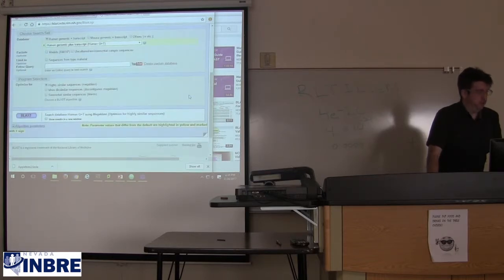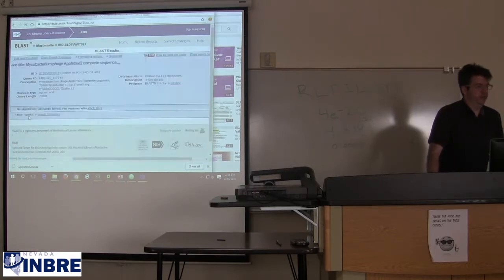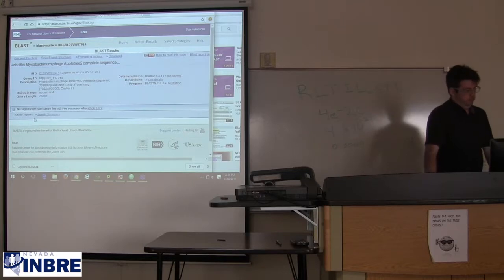And let's see if Megablast will find anything at all where we don't expect a relationship and where we're only going to be seeing things with poor e-values more than likely, and the noise of our algorithm trying very, very hard. Megablast won't find things that we are expecting to be false positives for this comparison of apple tree 2 versus the human genome.